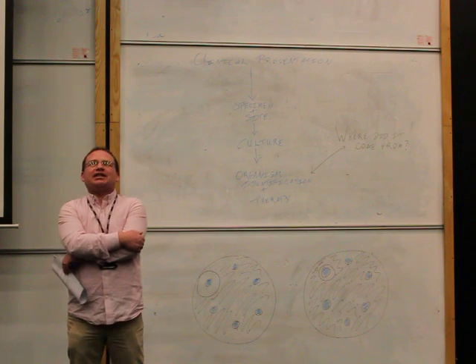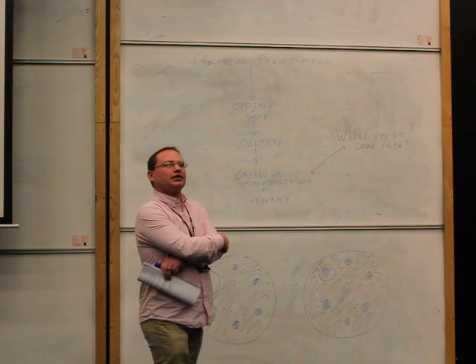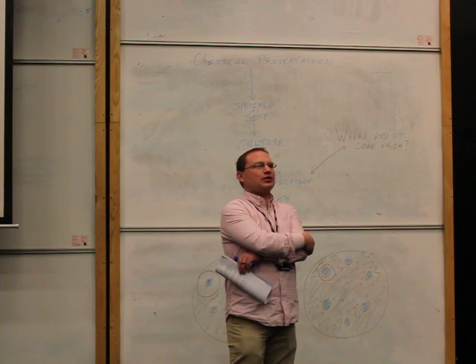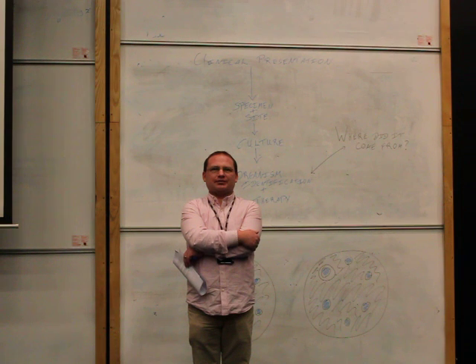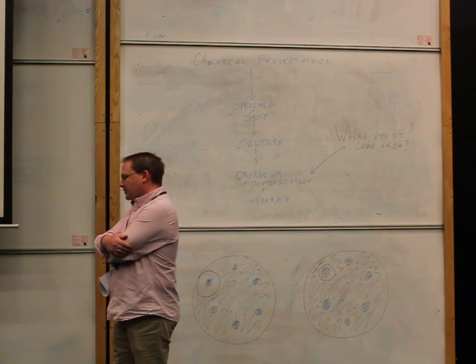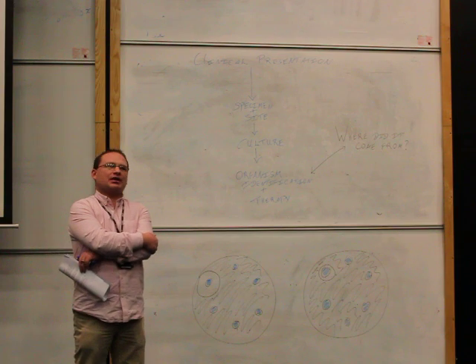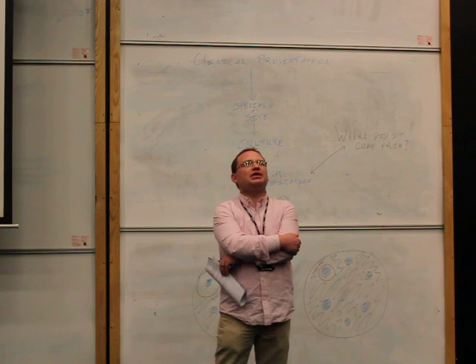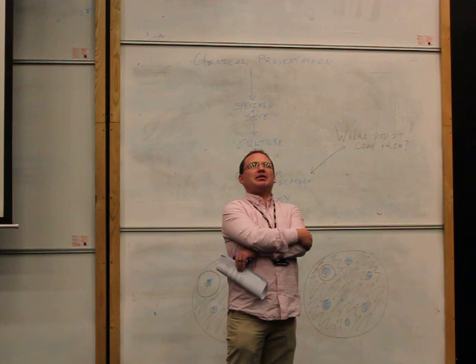And again, we have isolated different strains of Staphylococcus from each of those members of staff. And again, we want you, looking at videos and pictures that you will be presented with in the laboratory, to identify the different strains. What we then would like you to do is to look at the data. Is there any pattern? Is there something going on on that ward that they don't want going on in that ward? Is the person who has potentially given the baby the infection a member of that staff?